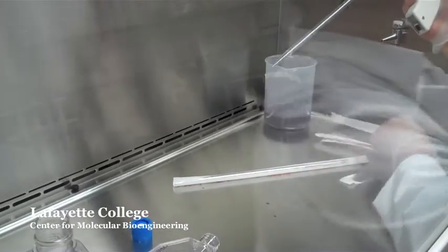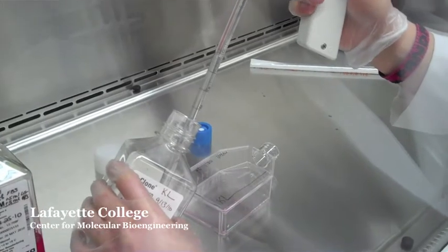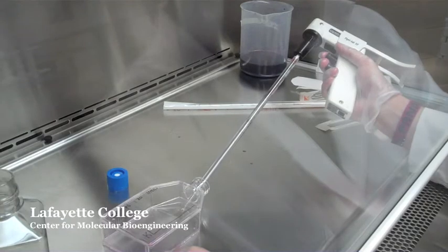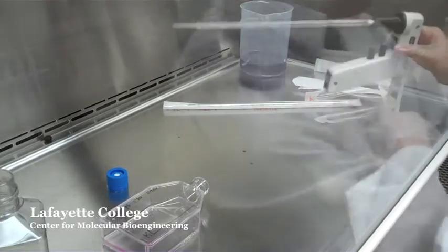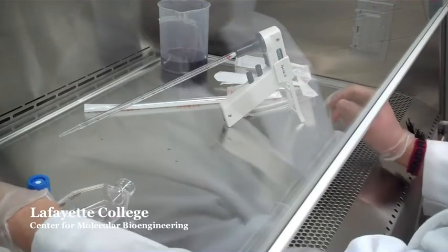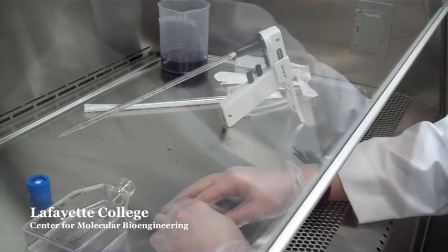Aspirate 10 mils of the PBS and put it into the flask. If the pipette tip has not touched anything, you can place it inside the hood — this will help you save materials, but ultimately sterility is more important. If the pipette tip has touched anything aside from the PBS, discard it and get a new one.